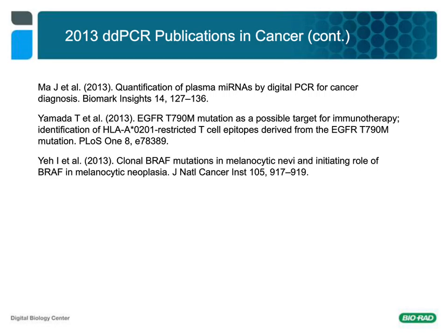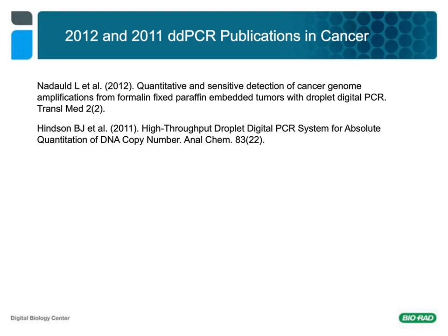Our next question is, what is the minimal amount of DNA for ddPCR reactions? Good question. We can detect single copies. The question really becomes a game of numbers. How much are you going to trust if you see one single positive mutant?